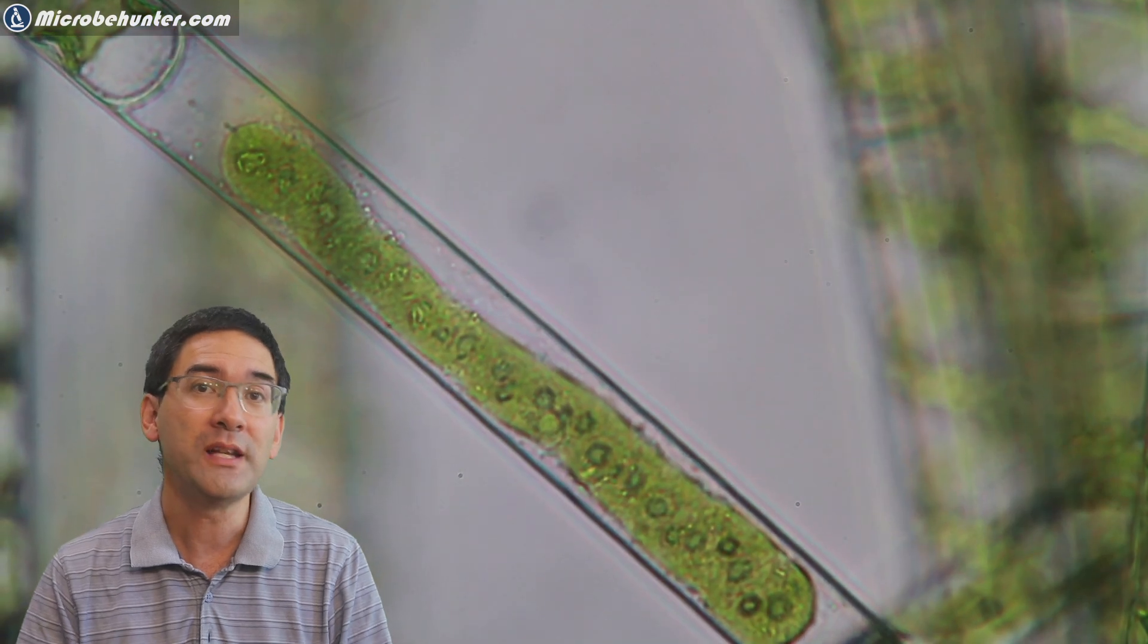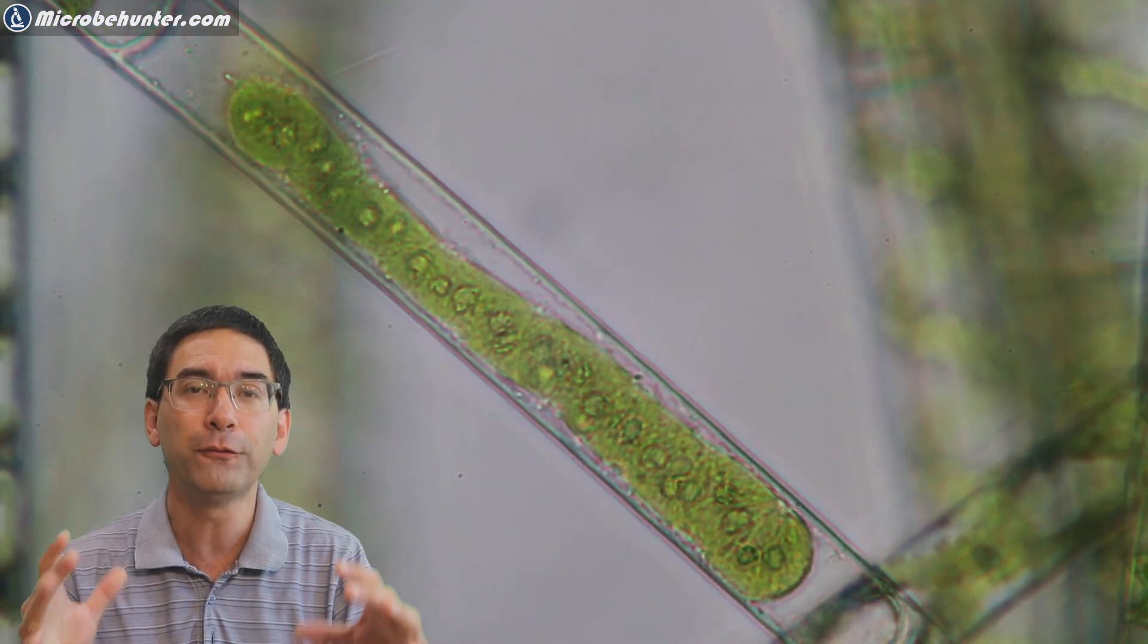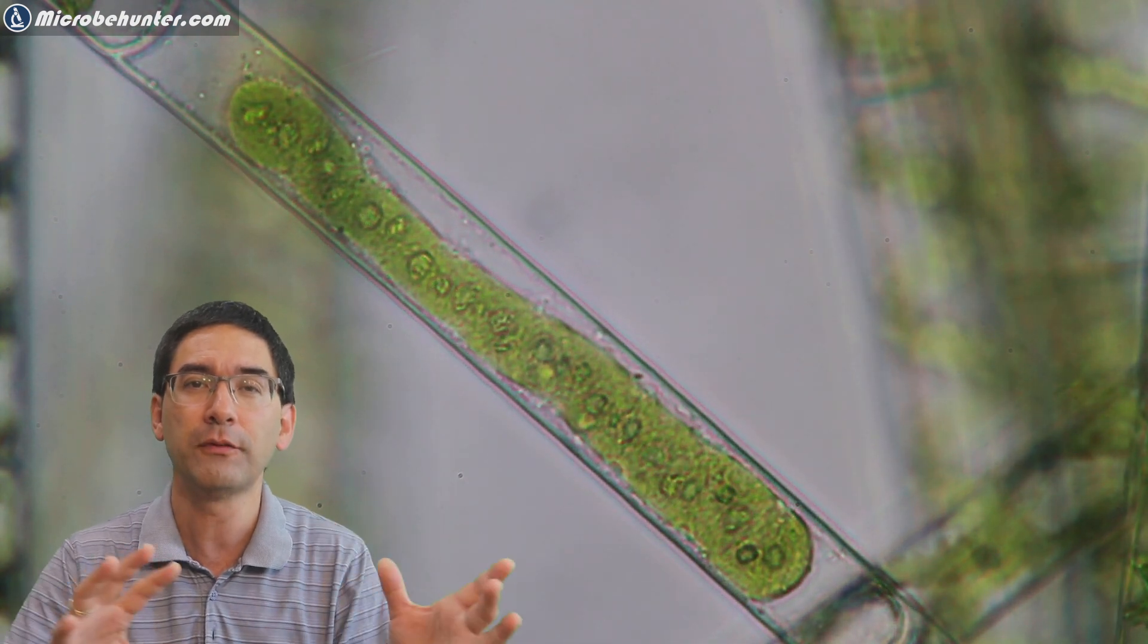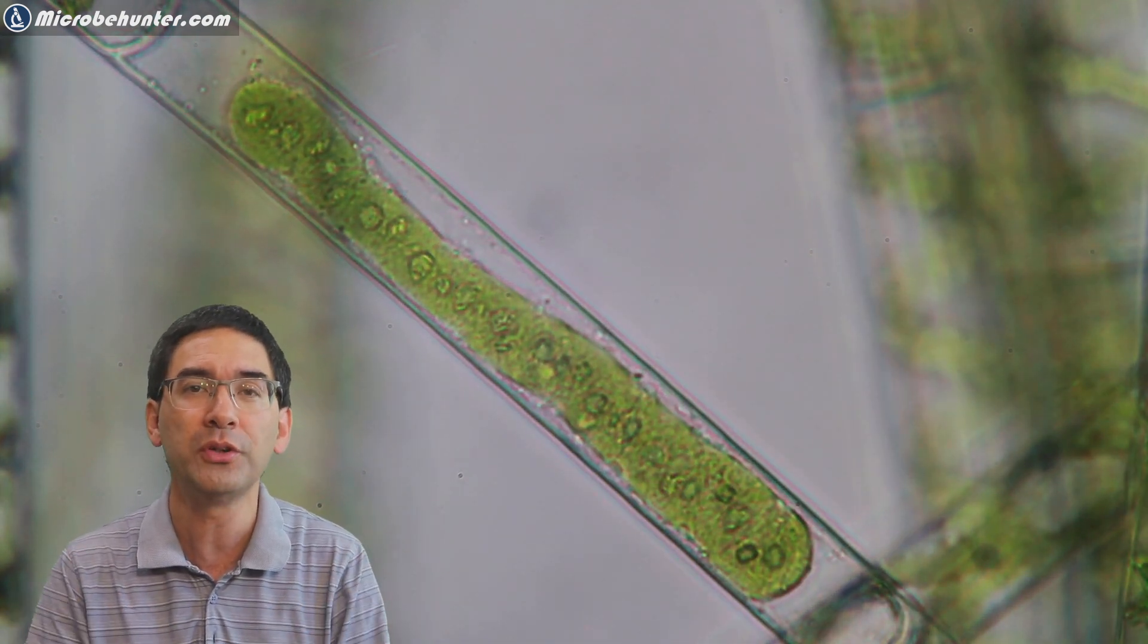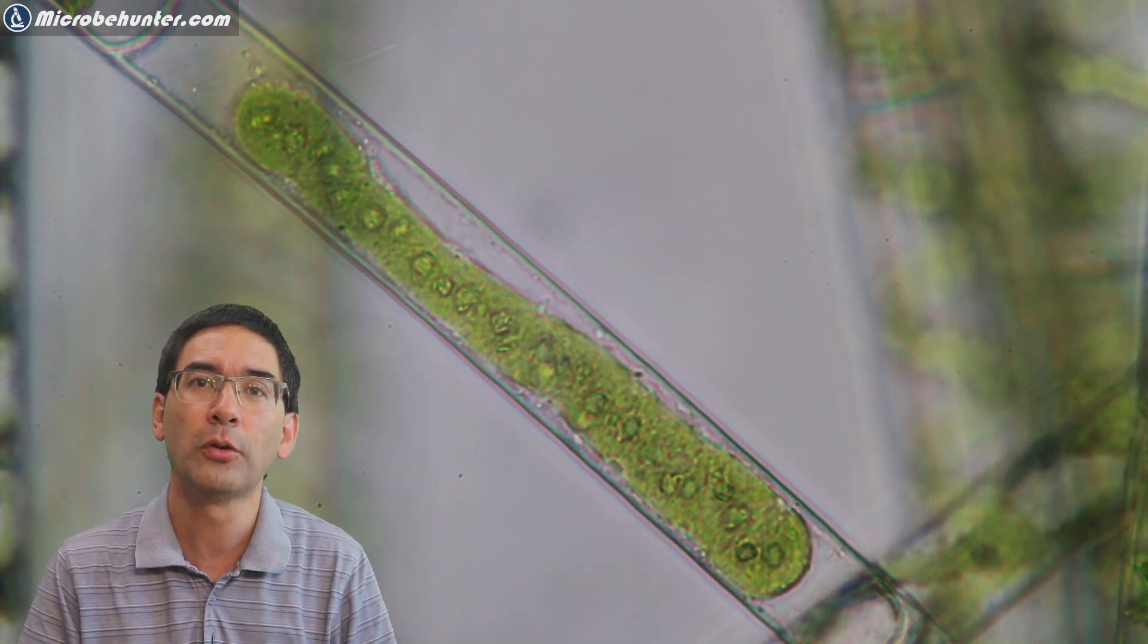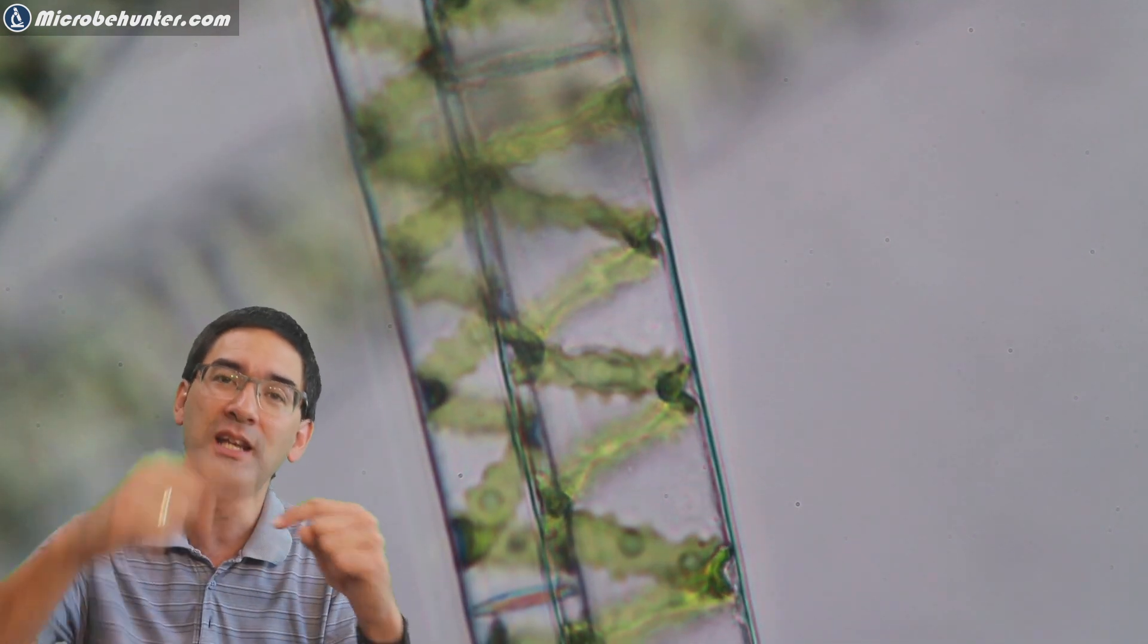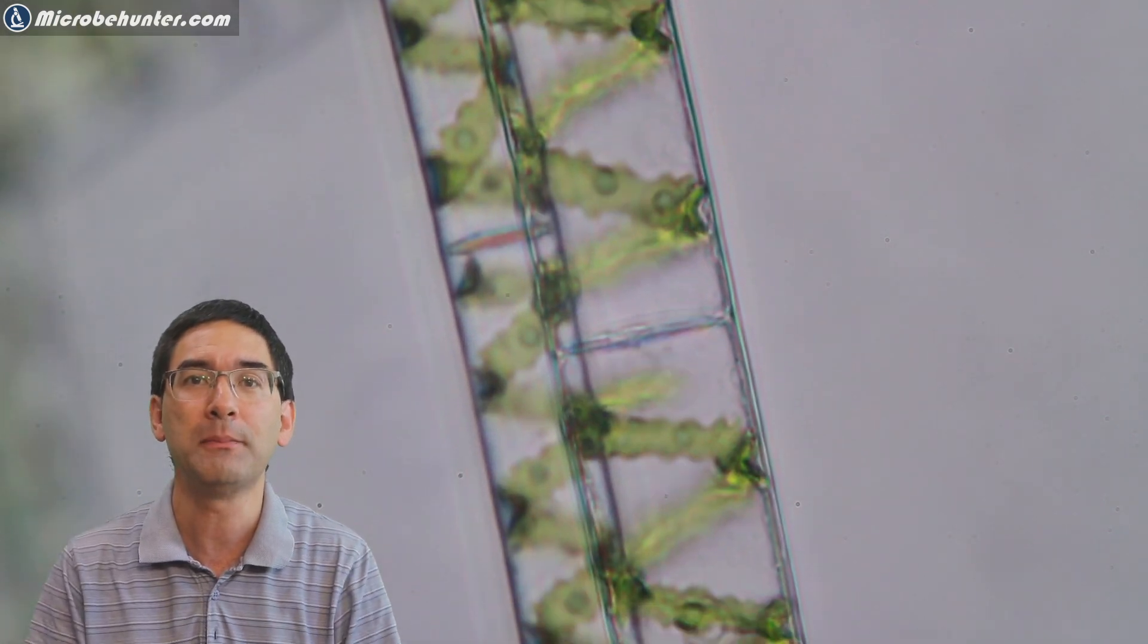The chloroplast in spirogyra is spiral shaped but occasionally there are cells in there that have a different shape. Now I don't know if this is already some kind of form of a cell specialization going on here, I have to do a little bit more research. If you know maybe why some of the chloroplasts have a different shape please write this into the comments section. By focusing back and forth you can actually see that the chloroplast is a spiral shape.